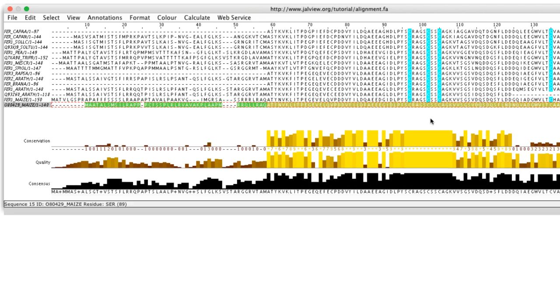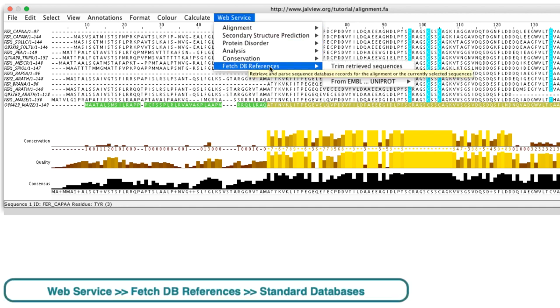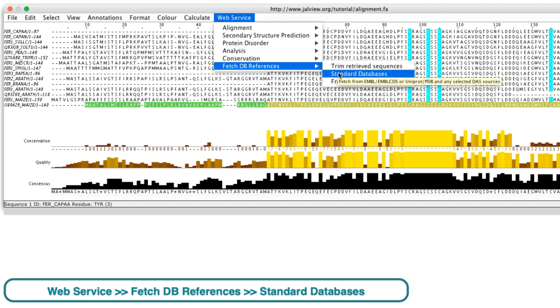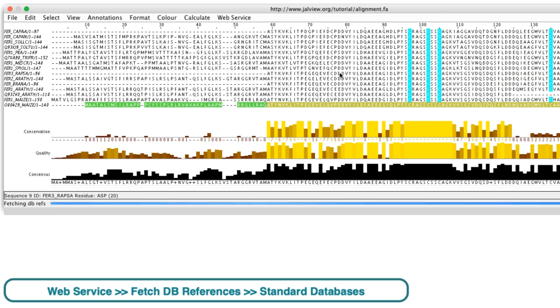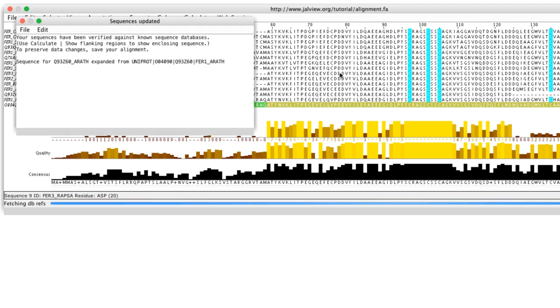I can load features for all sequences from all associated databases such as EMBL, PDB, and Uniprot. By deselecting the sequence using the escape key, go to the web drop down menu and select fetch DB references and then select the standard databases option. Feature retrieval can take some time if the alignment contains a large number of sequences.